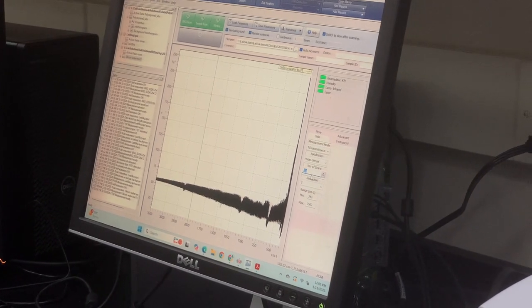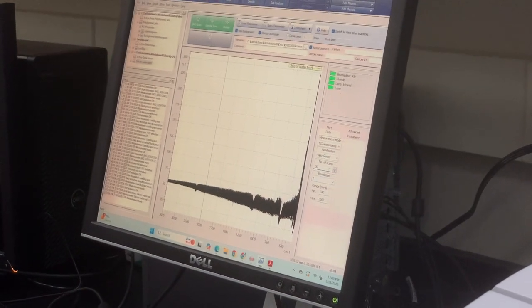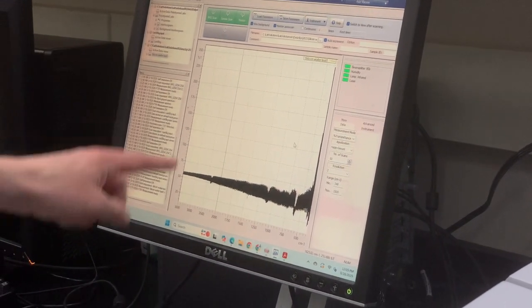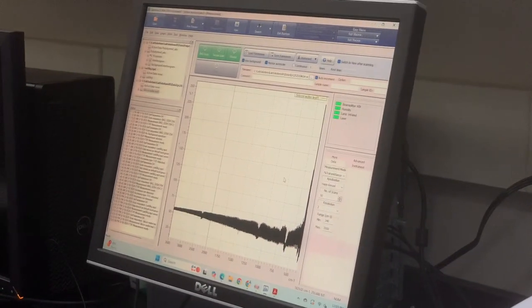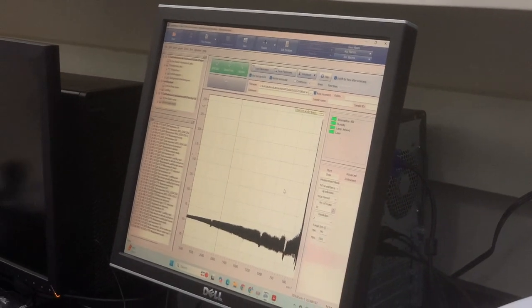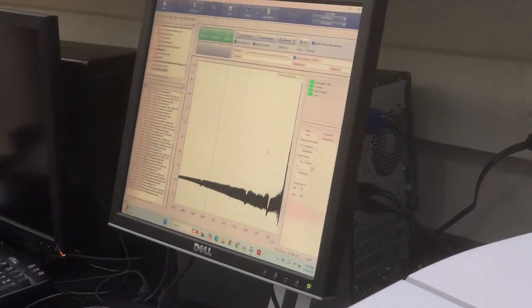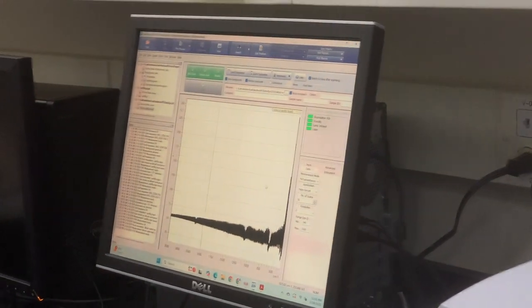Yeah, so let's do that. But we're not supposed to have an energy intensity more than 100%, right? If there's a 250, why are we proposing that? Transmittance shouldn't go beyond 100%, right? I would say that's reflective. Could it be? That's what I'm thinking. Yeah, it's reflective. So I wouldn't be surprised if there's a lot of bouncing back happening.